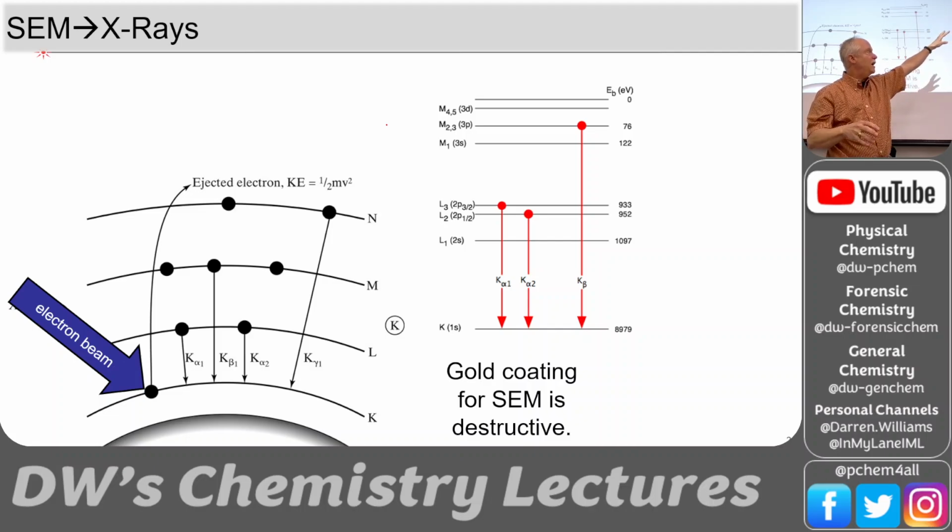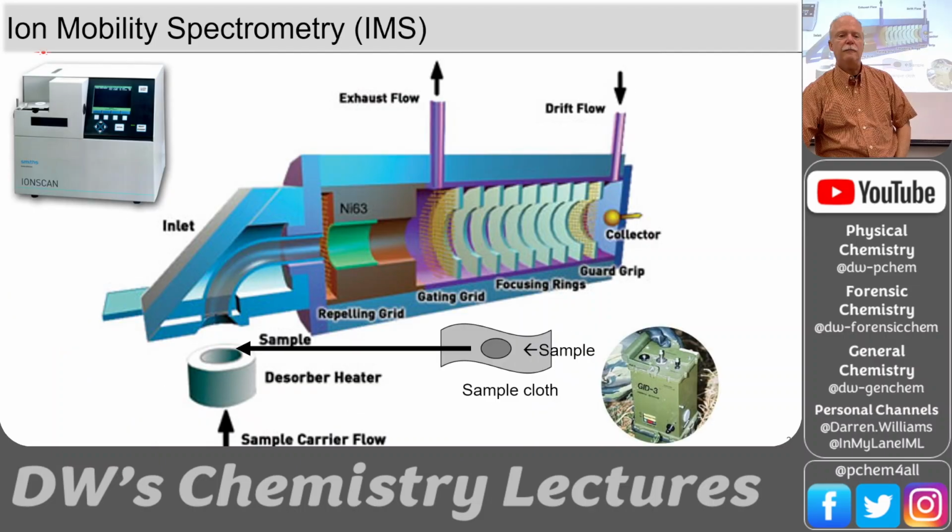We won't learn much about the oxygen, but if it has a trace amount of nickel or niobium or neodymium or whatever, all these trace elements in that glass, we're going to see. Because glass comes from sand, and depending on whether this sand was from this location or that location, we'll have different amounts and types of trace elements in the glass. And there are other samples that we do too, but glass is a good one for SEM X-ray analysis.